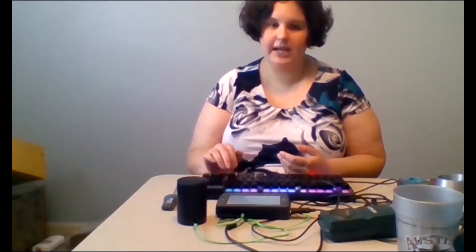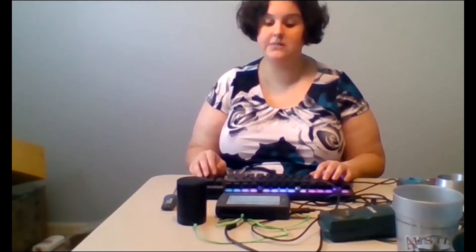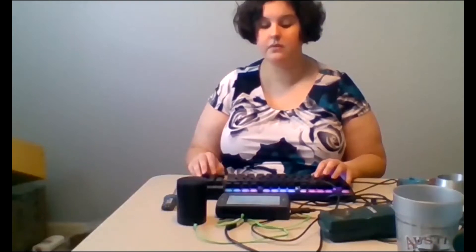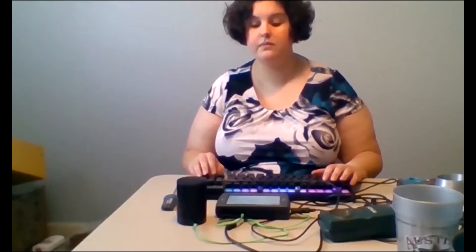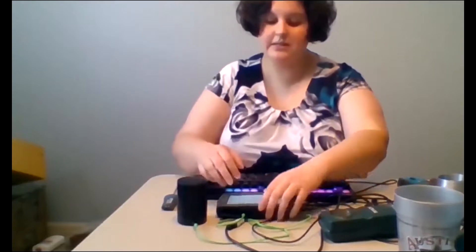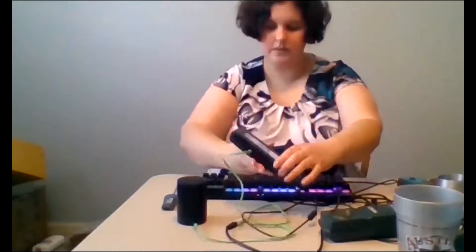After sonification plays, we can hear a nice increasing curve that went straight up, matching our data. If I want to know what happened at a specific point in the graph, I hit F12 and can navigate a specific section of the run using the down arrow key on my keyboard. At 3.5 seconds it reads 23.7 degrees. For anyone interested, that's what the table view looks like.